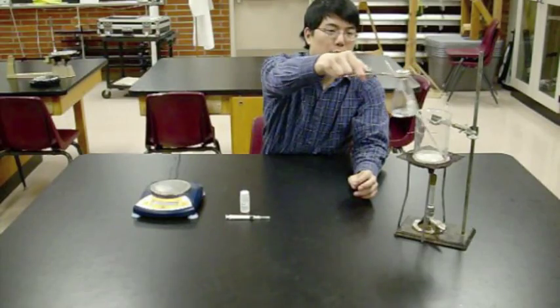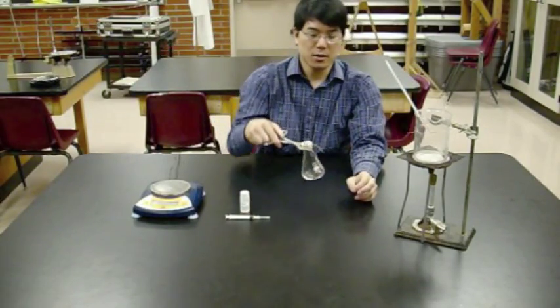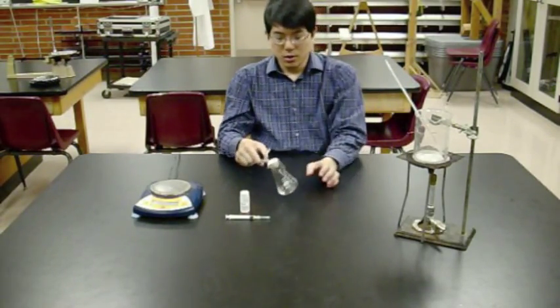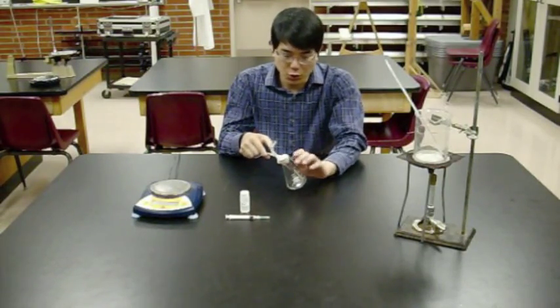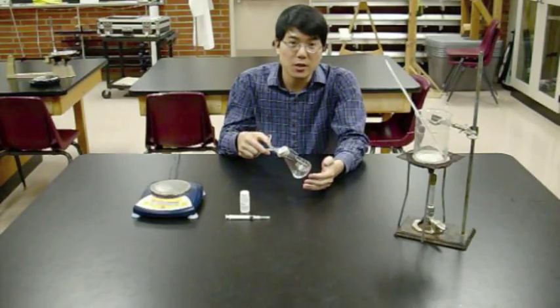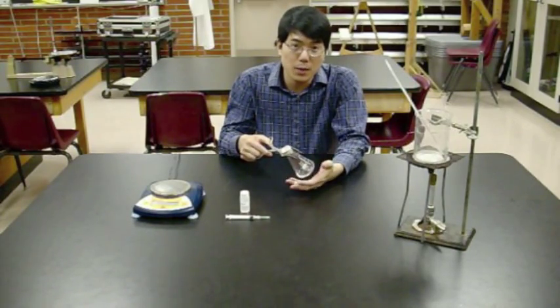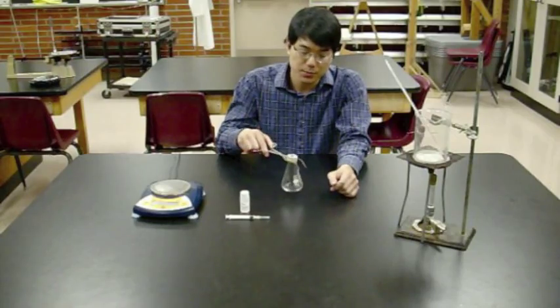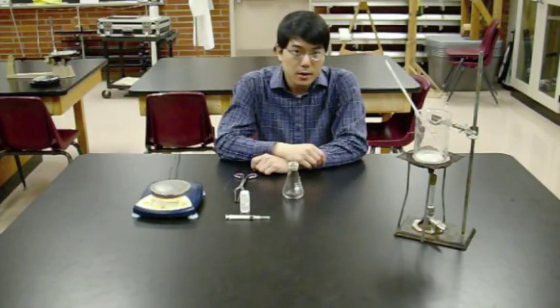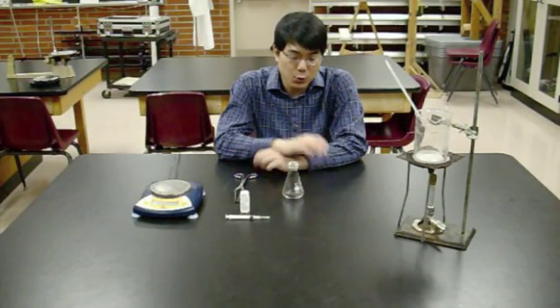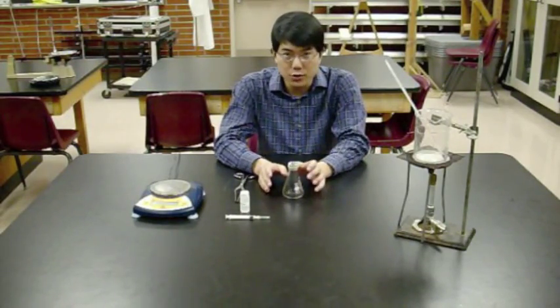Take the Dumas tube out of the hot water bath and put it on a towel. Dry off the glass walls to get all the water droplets off, otherwise they'll affect your mass measurements. Then let it sit.